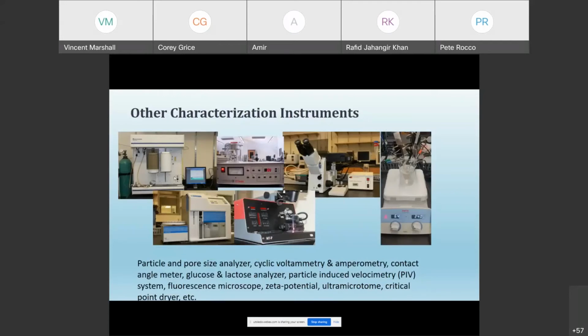We also have a complementary piece of equipment that can accurately determine volume of irregularly shaped samples, basically just using helium to displace it. And so by getting accurate volumetric measurements and knowing the mass, you can get accurate density determinations for samples that otherwise may not be amenable to techniques such as Archimedes' principle in doing water displacement.